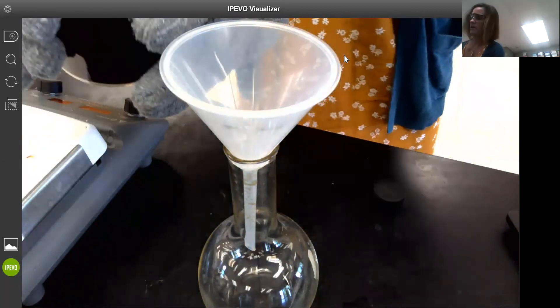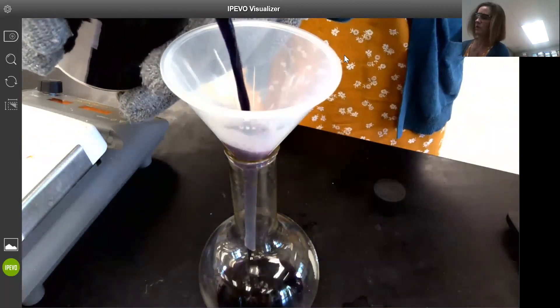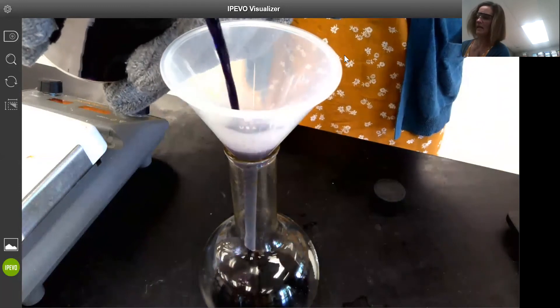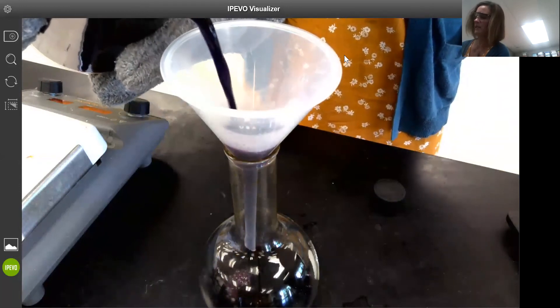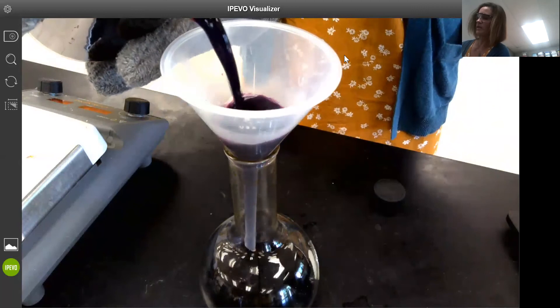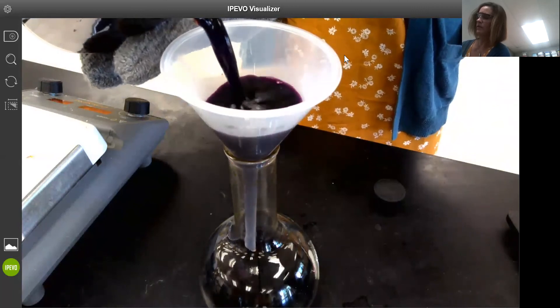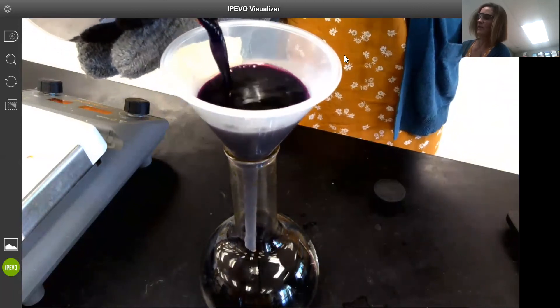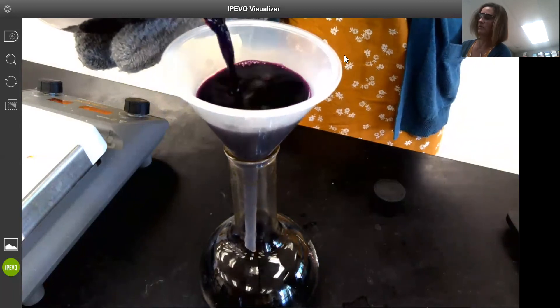Pouring a hot solution is always a safety concern, so I'm going to protect my hands and slowly transfer that solution to the Florence flask. You can see that intense purple color. This will stain your hands or your clothing or your skin if you get this on you, so obviously you want to take care whenever transferring the solution.